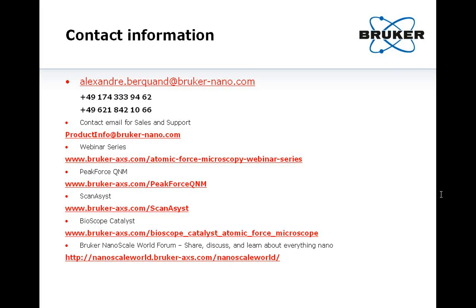But it appeared that it worked quite well on biological samples. The second reason is I think the DMT model is quite widely used for many nano indentation works. This is the most commonly used. So I think this is the main reason why we chose the DMT model.